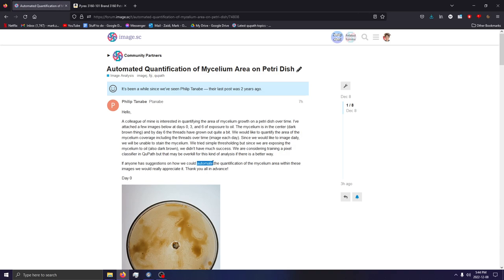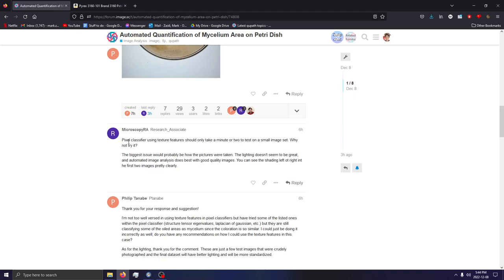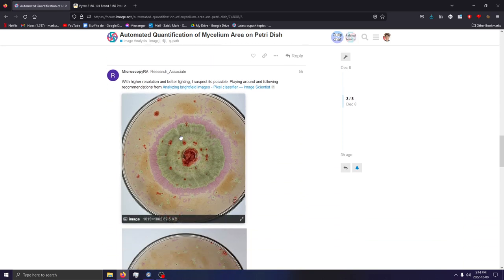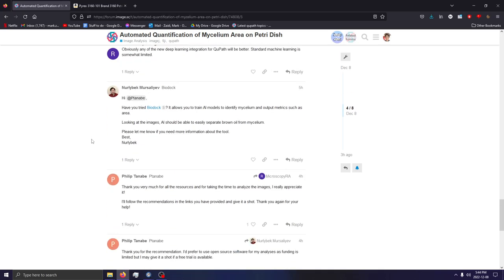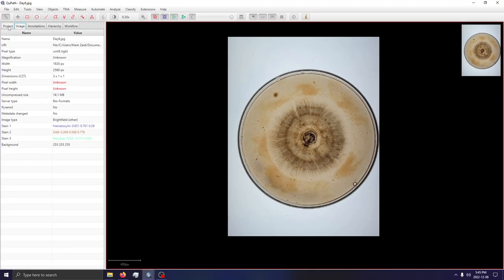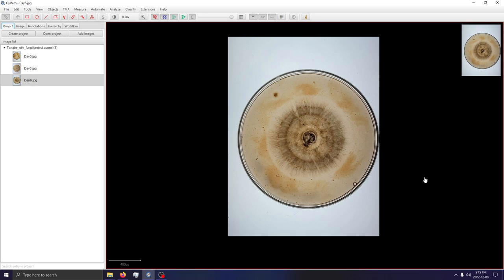The keyword here is automate — that's the tricky challenge. In the first part of the video I'll show some of the more manual tools you can use to quantify area measurements, and then I'll give my best shot at automated quantification. Someone commented that using a pixel classifier with texture features is probably the best bet — with enough feature augmentation you should get a reasonable pixel classifier. So let's give it a shot. I've already loaded a project with the three images downloaded from the forum thread.